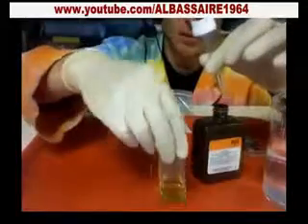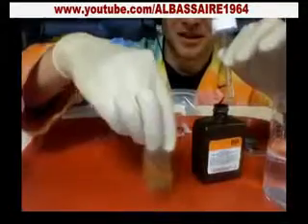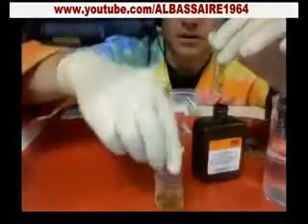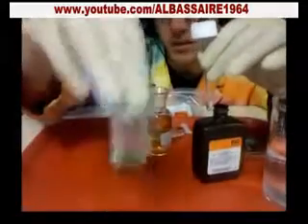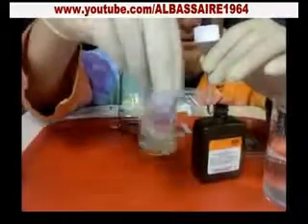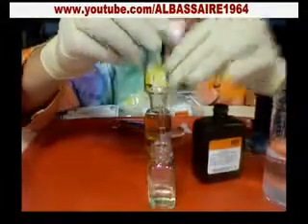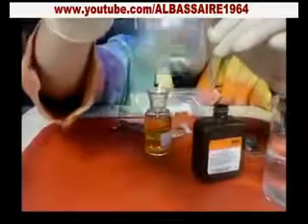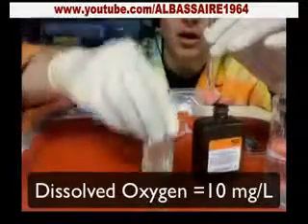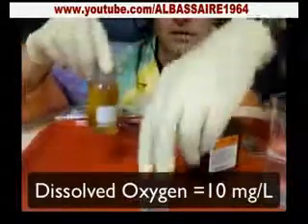Between each drop, I'm going to mix it up. This is 4, and let me add 5. You want to be careful. So that's 5, and you can see that it's still yellow, but we're starting to turn it towards clear. So that was 7. Now let me add an 8th drop. Sometimes you have to hold it up to something white. So that's pretty close. So that's 9. I think maybe one more is going to do it, so let me add one more drop and mix it up. Now that's totally clear. So 10 drops is how much we had to add to make that turn from the yellow color we had a second ago to the clear color that we have right now.